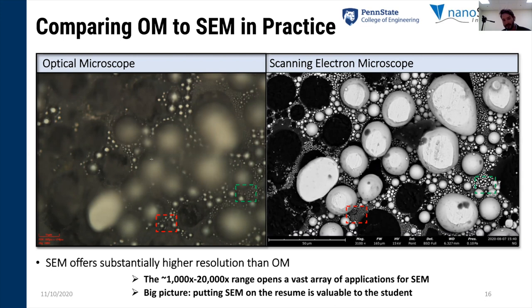I went through Penn State's Nanoscience NMT program close to 15 years ago. I went through that program and I got to put SEM as a bullet point on my resume saying, hey, I know how to use an SEM. And within 6 months of finishing the nanotechnology program, I got a job at a small company using SEM as part of my job as a process technician. So it really is valuable, I think, for our students to be able to say they have SEM experience.